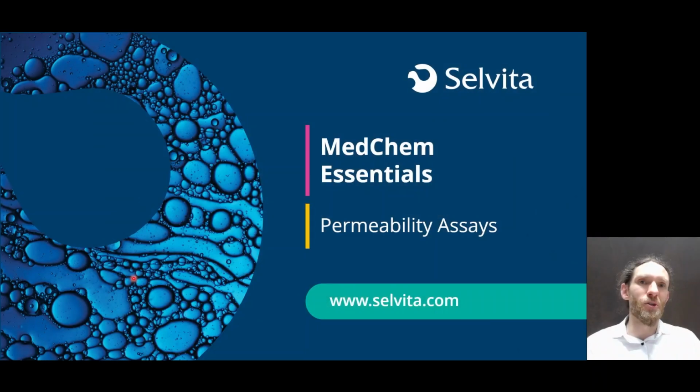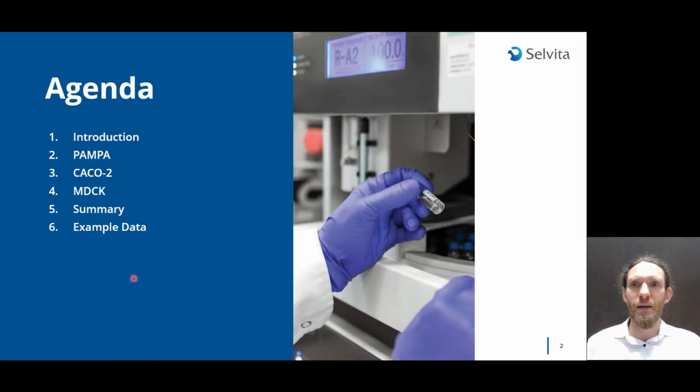Today we continue talking about permeability with the focus of permeability assays. Today's presentation will begin with some introduction of basic concepts. Then some assays like PAMPA, CACO2 and MDCK will move on to the summary comparison of these assays and present some example data.